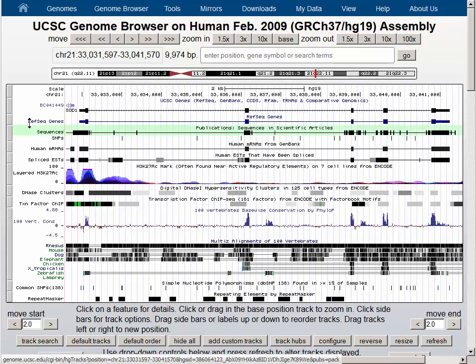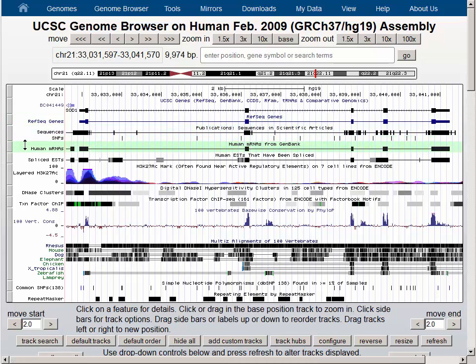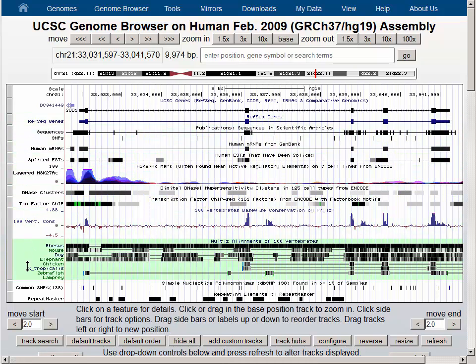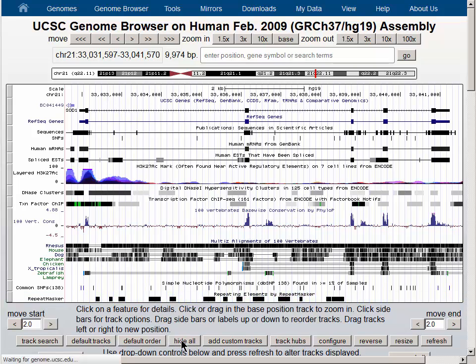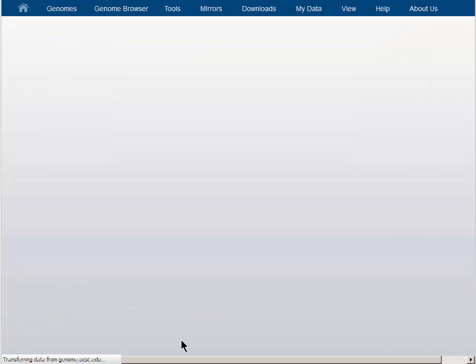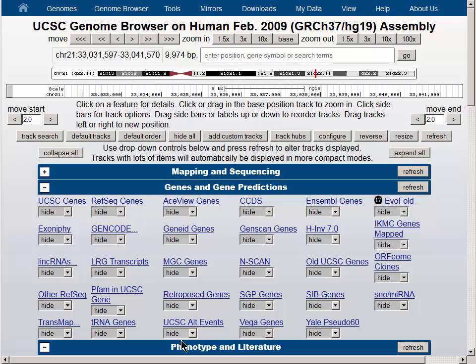There are a large number of data tracks turned on by default on the Genome Browser, and the most convenient way to deal with them is to hide them. Then we'll turn back on the tracks that we're most interested in.